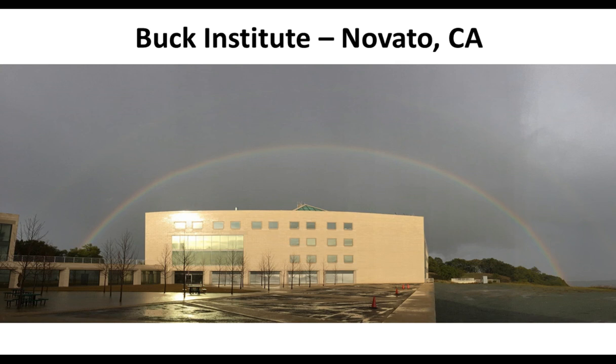So the quantification that we do afterwards in Skyline from the DIA acquisitions is so clean and has so little interferences. That is really important to us, because the quantification of different conditions is what really brings in biological interest.